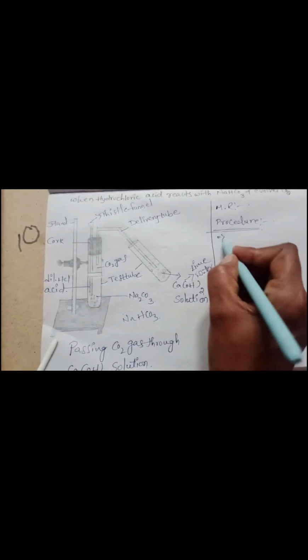In the procedure, first we arrange all the equipment as shown in the figure. That is the first point.